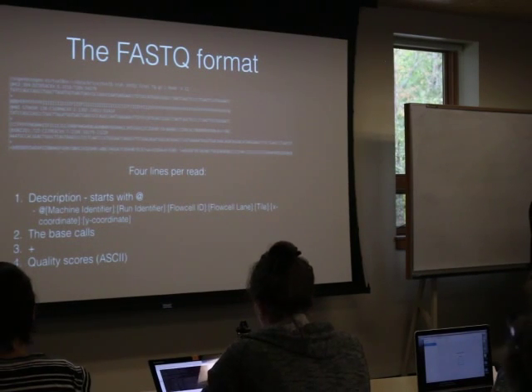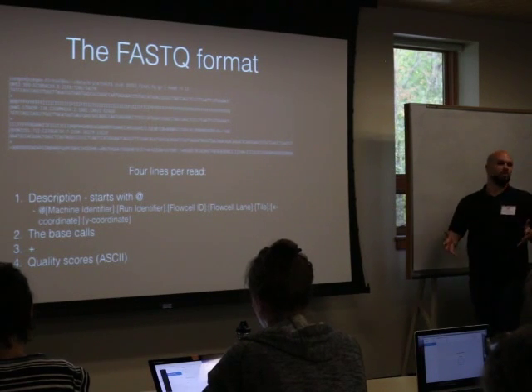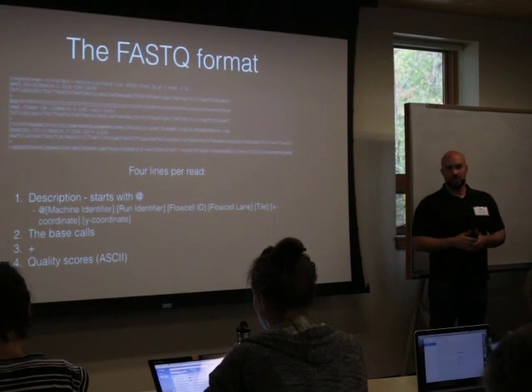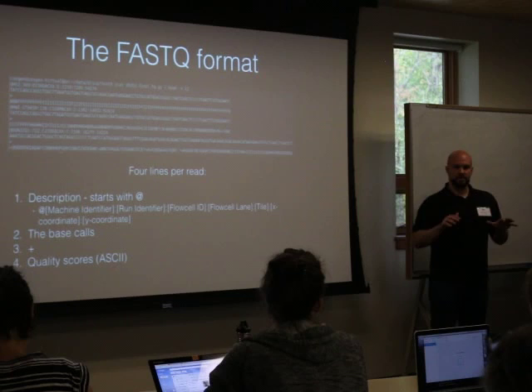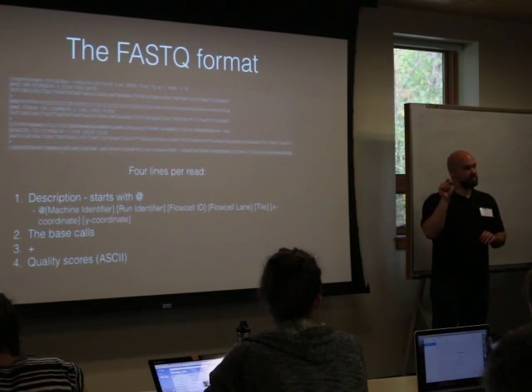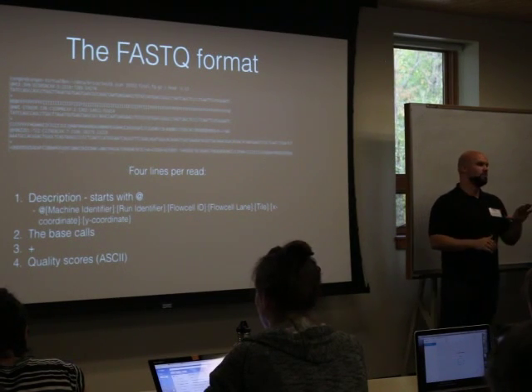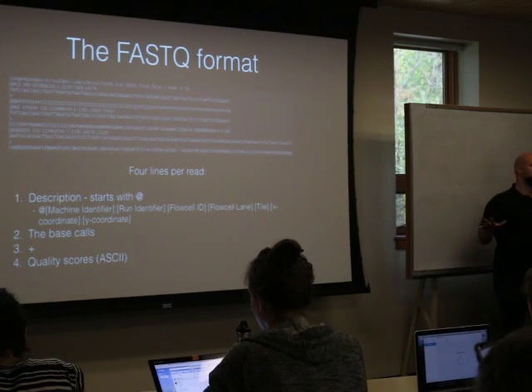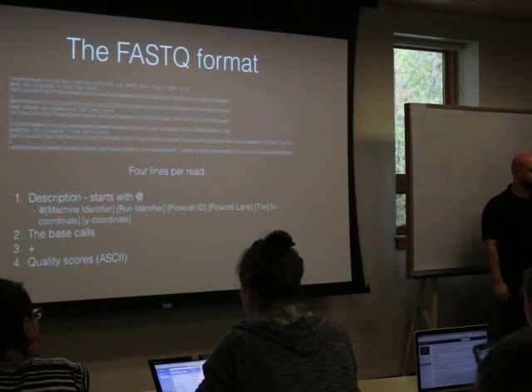So I noticed that there was a little bit of confusion yesterday about, if I have GATK, how do I run GATK on the command line? And it's not as simple as calling GATK in some cases, but I enumerated those. So if you are running it locally or on the Docker container, depending how things are set up, there might be little differences in the way that certain programs are called. Almost certainly not unless you're going off script, but this should help you not only in this workshop session, but also when you get back to your particular university, where your system administrators have things set up like that.